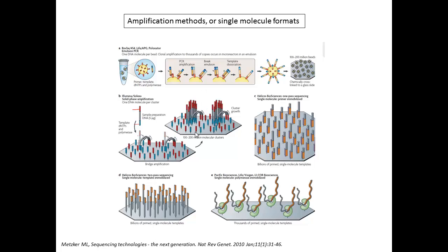And although that might seem surprising initially, this will happen locally many times for a particular single molecule. We've had a single molecule that's been folded over many times, binding to primers on the surface, which are obviously at higher density than pictured here, and these molecules will be amplified. They'll be geographically close to each other, and they won't interfere with a second molecule which bound over slightly to the side on the surface, which is also going to be amplified.